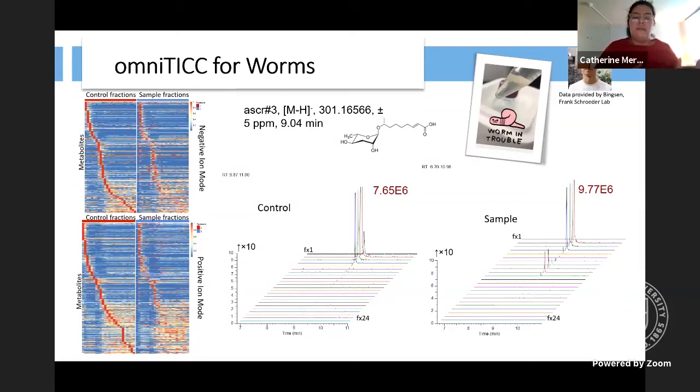And when we look at this, we have worms performing OmniTIC. So on the left side, we have more heat maps, kind of just distinguishing where we see differences in the control and sample fractions, once again, of different metabolites. We have the negative ion mode and positive ion mode, which are just different detection methods for the mass spec. So one of these that Vincent provided the data for, that they're interested in, is ascarylose 3, which is a worm hormone. And we can see from the graph that from the control to the sample that we get peaks in later fractions, indicating that there's probably a PMI in that fraction.